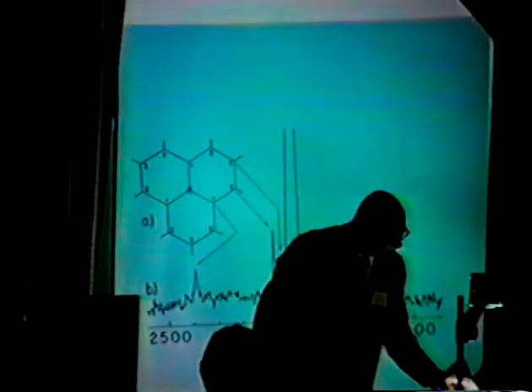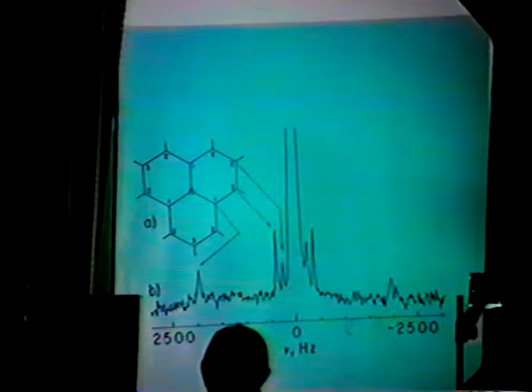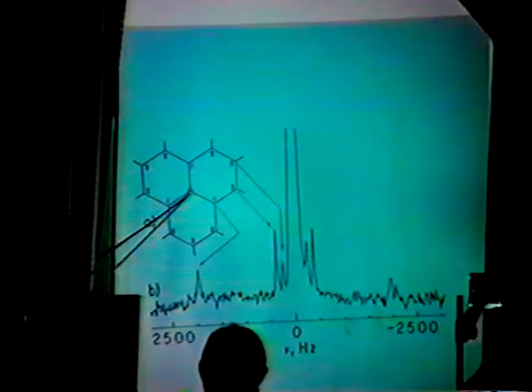One of the byproducts of this is the spectra are so sharp that we can use NMR to measure the dipolar coupling between neighboring carbons. In other words, carbon-13 is only about 1% abundant. Suppose we concentrate on the central carbon.